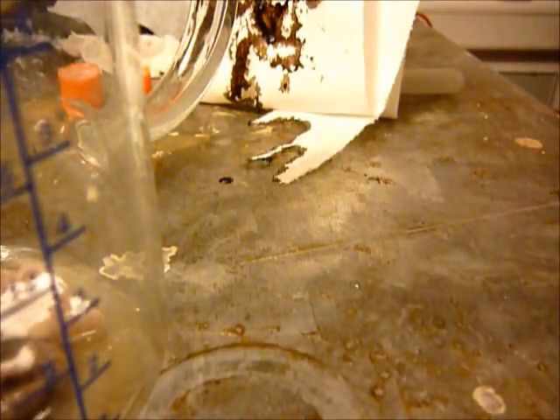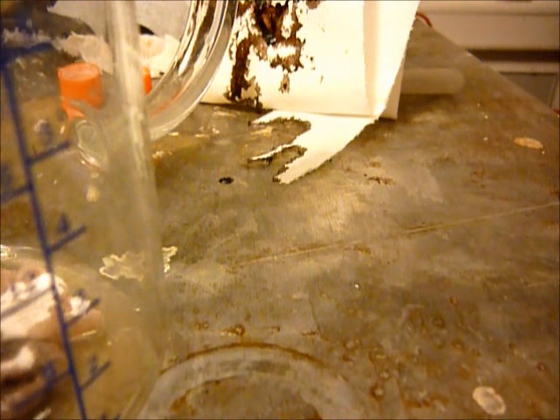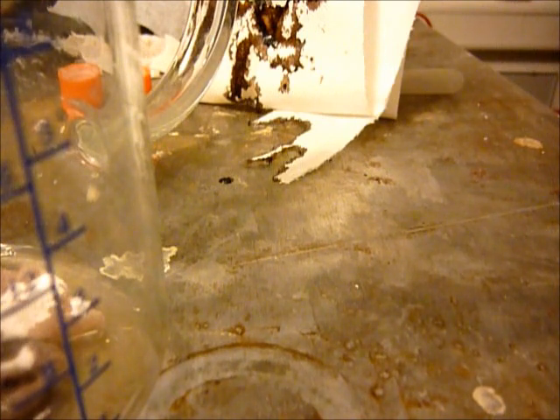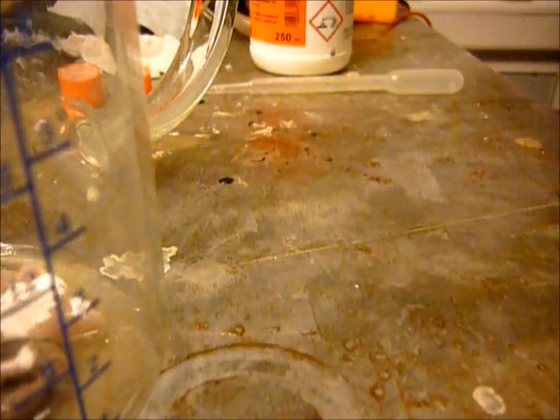And also the tissue is etched. So it will attack the clothes that you are wearing if you get some on your clothes, and then it will etch up to the skin, and then it will etch you. So you must be very careful when you handle this.